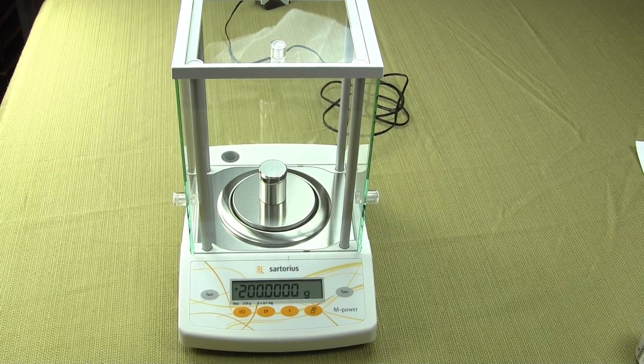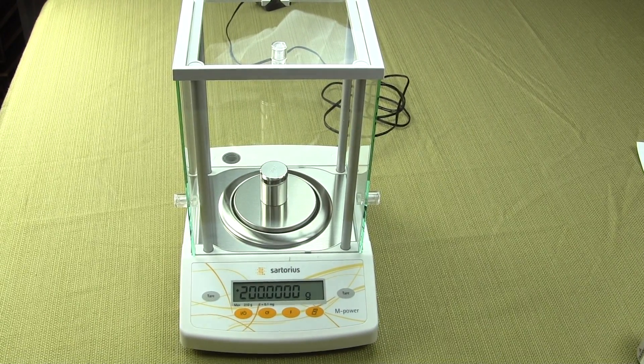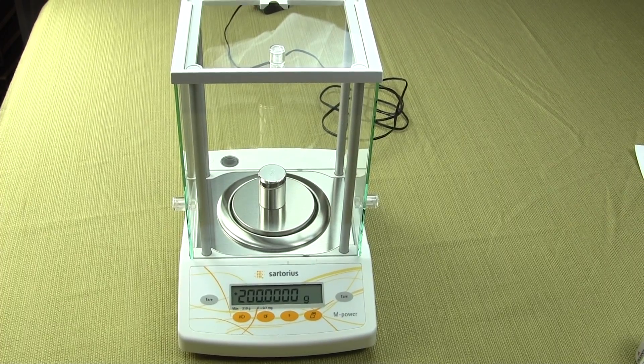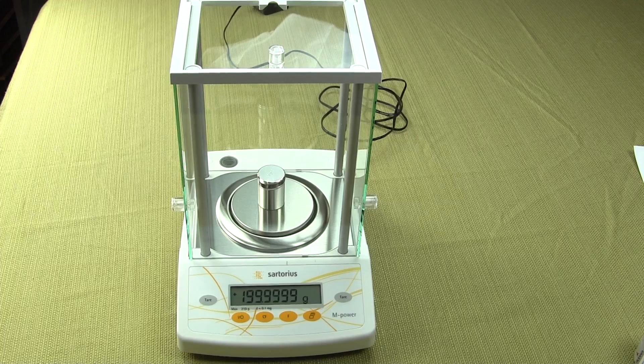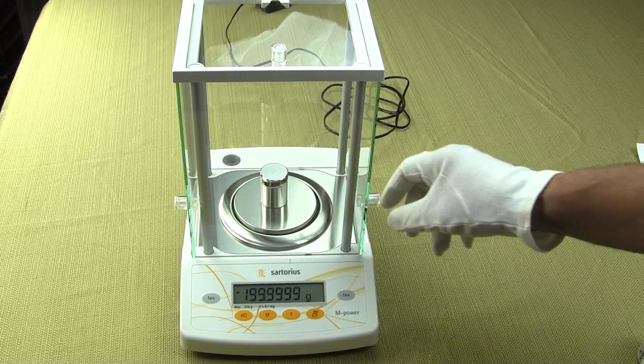Welcome to Precision Weighing Balances. Today we're going to show you the Sartorius AZ214 Analytical Balance. This is Sartorius' economy version of an analytical balance.